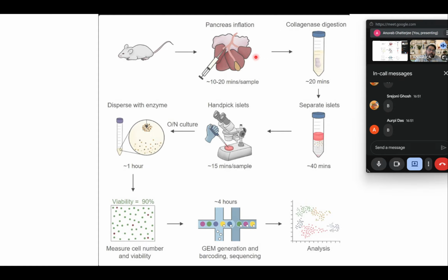This extracellular matrix essentially works as a platform on which the cells can sit, and then they adhere to the extracellular matrix as well as each other to form the entire construction of the tissue. Using ECM degrading enzymes such as collagenase, you can break the bonds of the ECM and separate the entire tissue into a single cell suspension.